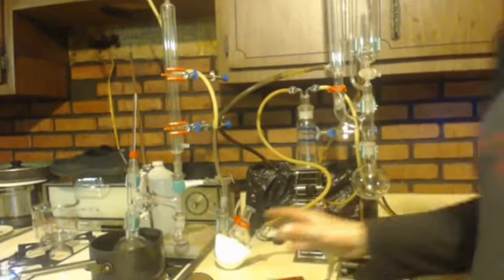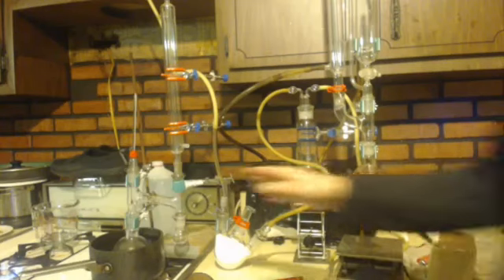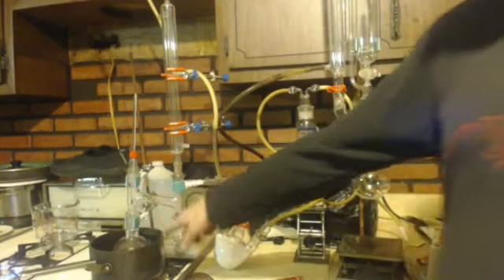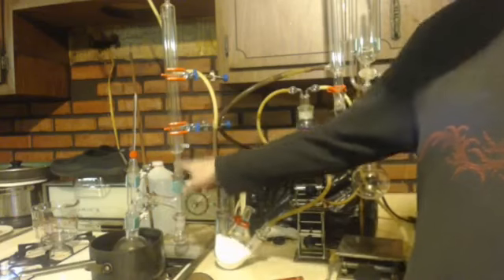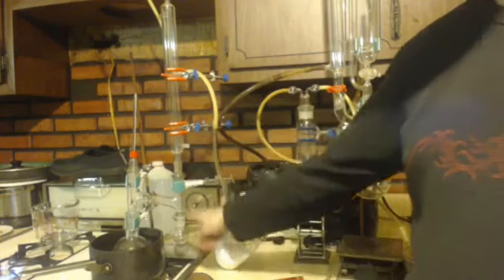if you watch my video on how to make anhydrous carbon dioxide, this is the same exact apparatus. I have my baking soda in here. I'm going to heat it up with an oil bath. It's going to come up here just like the Dean-Stark apparatus. It can't get past this condenser, right? The water will drain back down.